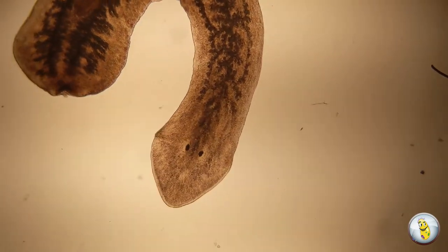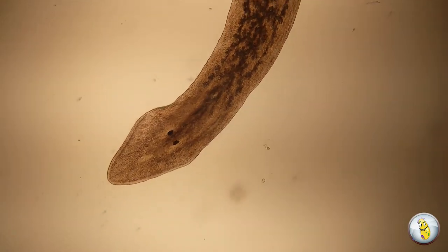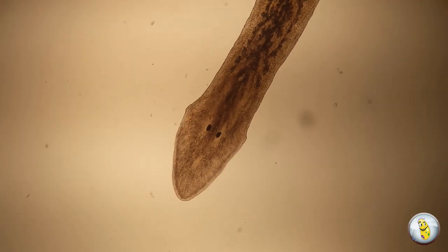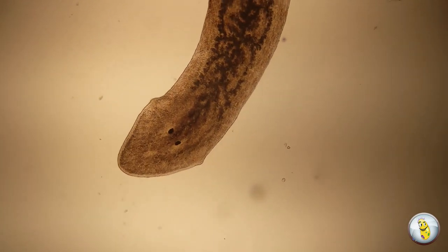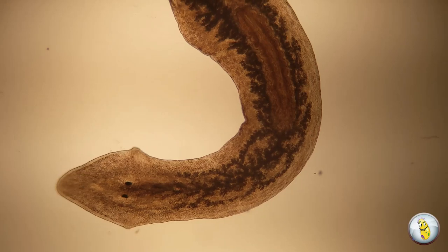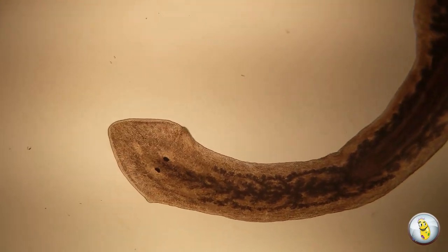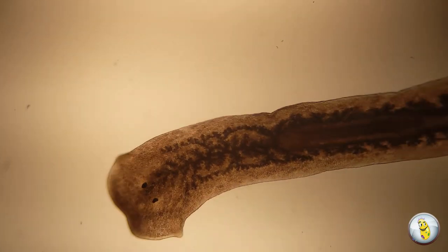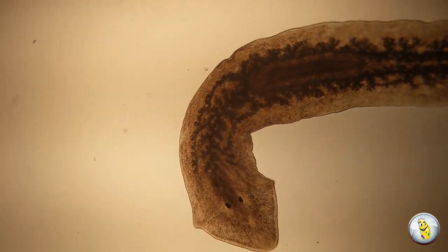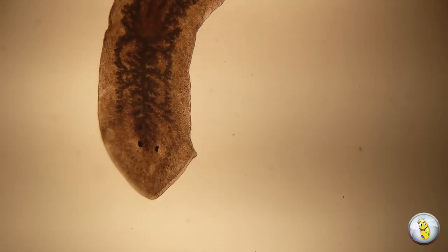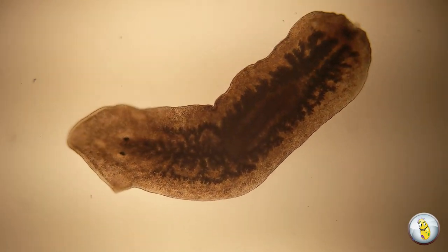For my experiment, I decided to take a planarian that was about 8 to 10 millimeters long and cut it into three parts. I cut the head off and the tail off, which left a middle body part. And I documented every other day or so the sort of changes that I saw. And I was amazed, as I think you will be, at the result.